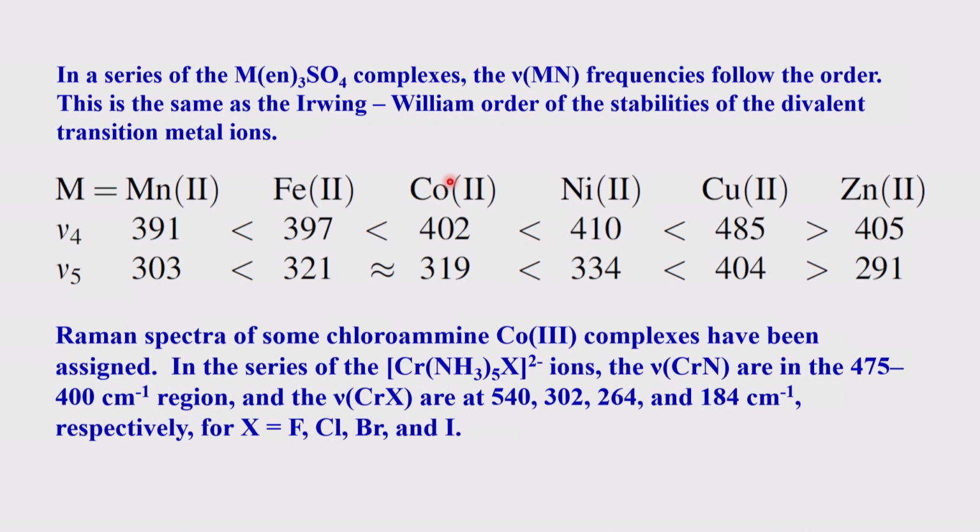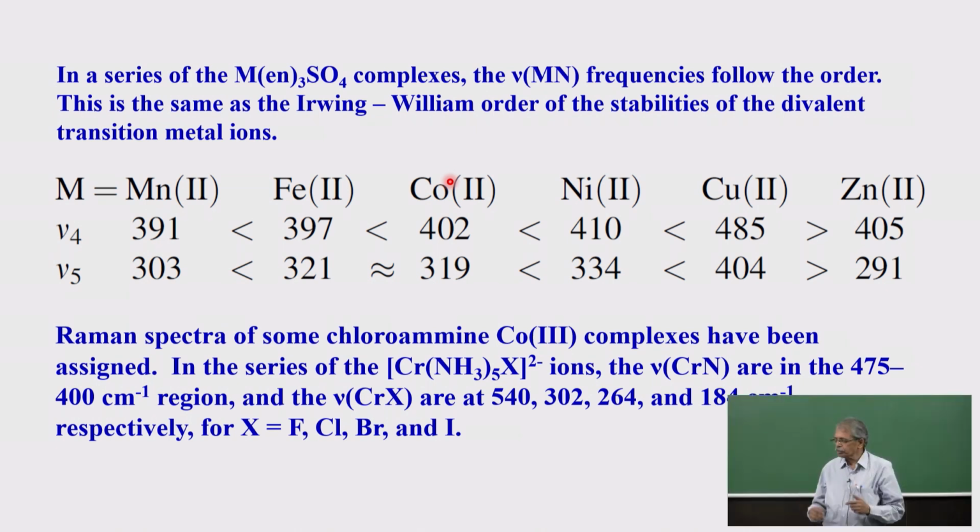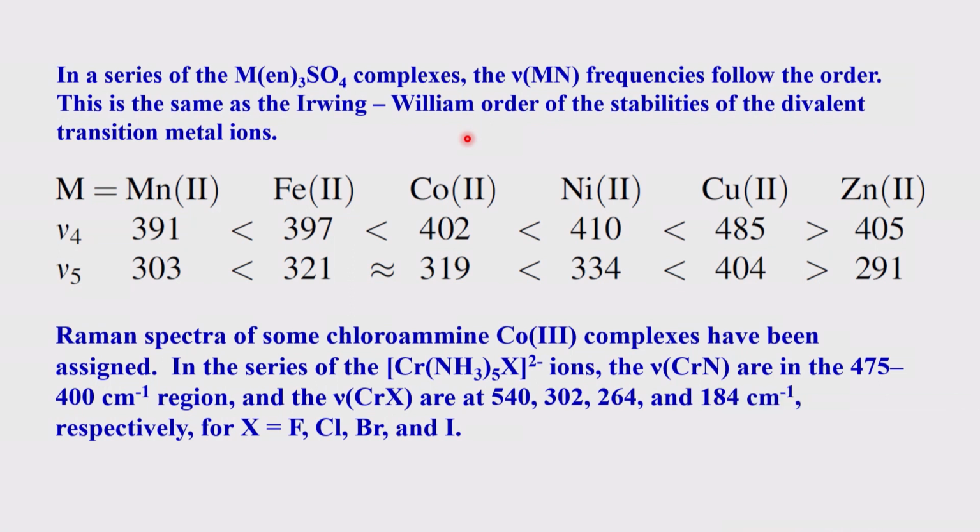I have also demonstrated how the geometry, cis versus trans, matters: the lower the symmetry, the greater the number of bands or splitting, and the greater the symmetry, the fewer the bands. This is very commonly found, and even more easily found in carbonyl chemistry. Based on the number of bands, the symmetry and the corresponding structural aspects can be fixed. So from the number, shape, size, position and intensity of the bands, you can determine structural and symmetry features. Comparative study is the best way.